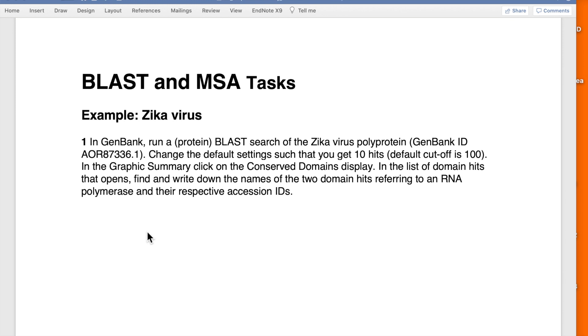Hello, I'm going to go through the exercises relating to BLAST similarity searches and multiple sequence alignment.